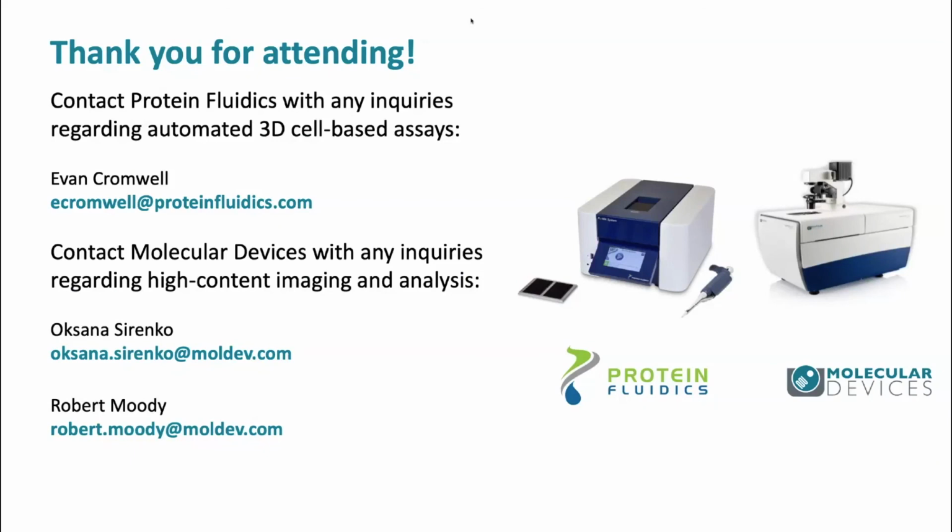Lydia also asked if you have to use Matrigel to hold the organoids in place, but Evan, it sounds like you've already addressed this, but I'll let you elaborate. That's correct. Once the organoids are in that bottom protected chamber, they stay in place very nicely. We have also used a NanoShuttle, a product of Greiner Bio-One, where you can either use the little magnetic particles to help form your organoids, or coat the organoids and then use magnets to hold them in the bottom of the well.